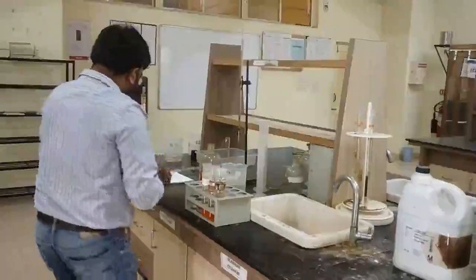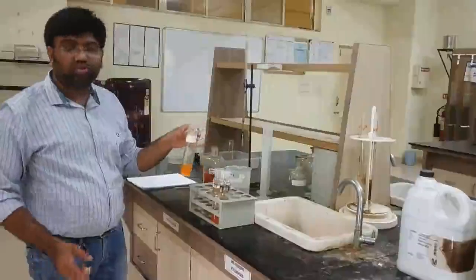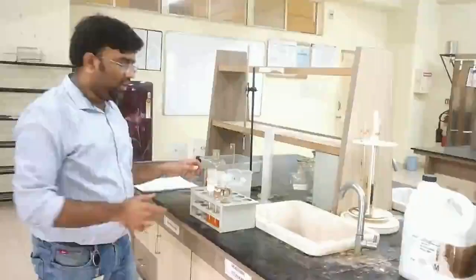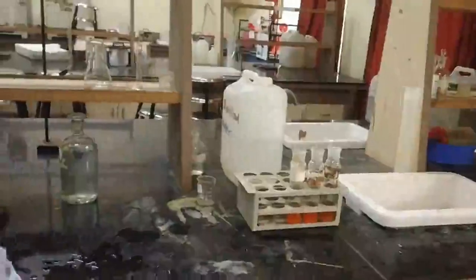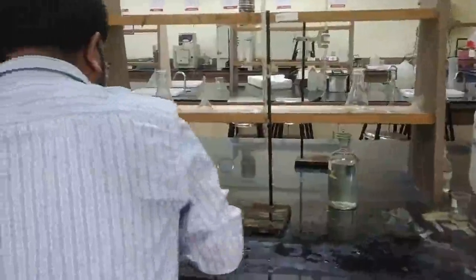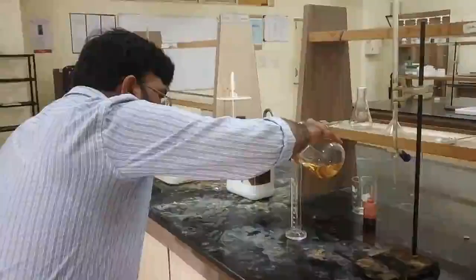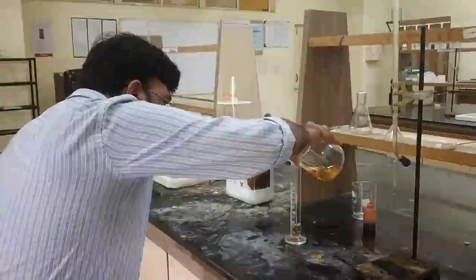Now according to the manual, the next procedure is to add 30 ml of concentrated H2SO4 in each of these flasks. Very carefully we are going to complete this procedure. I will be moving to this wash vessel, and I will be adding the H2SO4 in all of them. Previously, at the time of the titration, we added it into the conical flask. Here we have to put it in the digestion flask. The utmost care is to be taken.